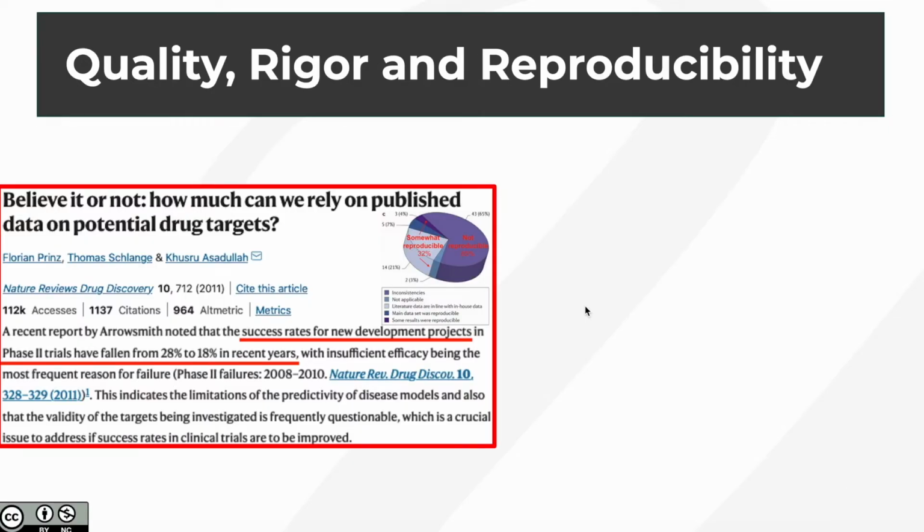The next topic I want to address, while trying to find a reason why quality control and documentation are important for imaging experiments, is the topic of data quality and reproducibility. As we are all likely aware, alarm bells about the poor quality and reproducibility of preclinical studies have been repeatedly sounded by drug companies attempting to follow up on drug targets.